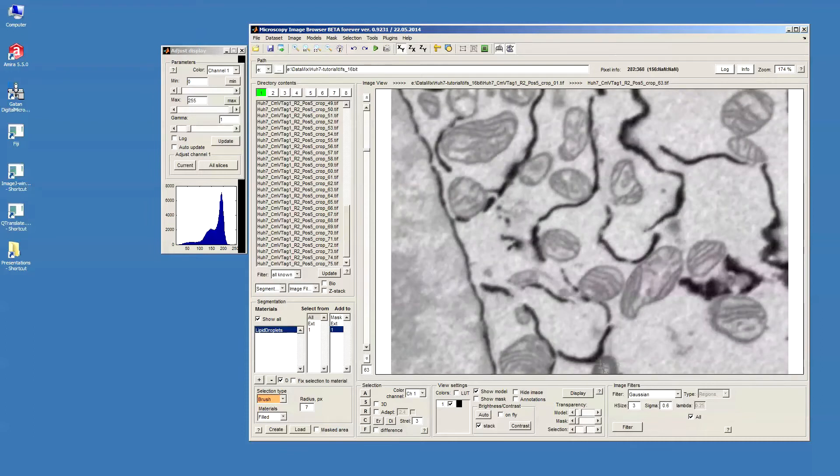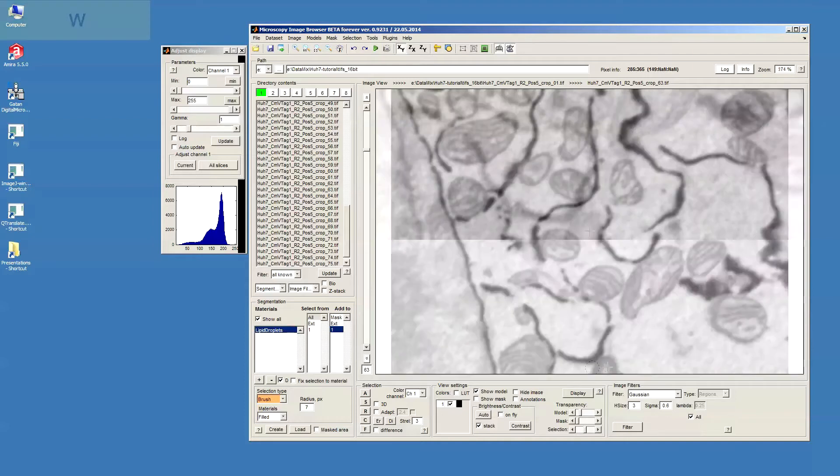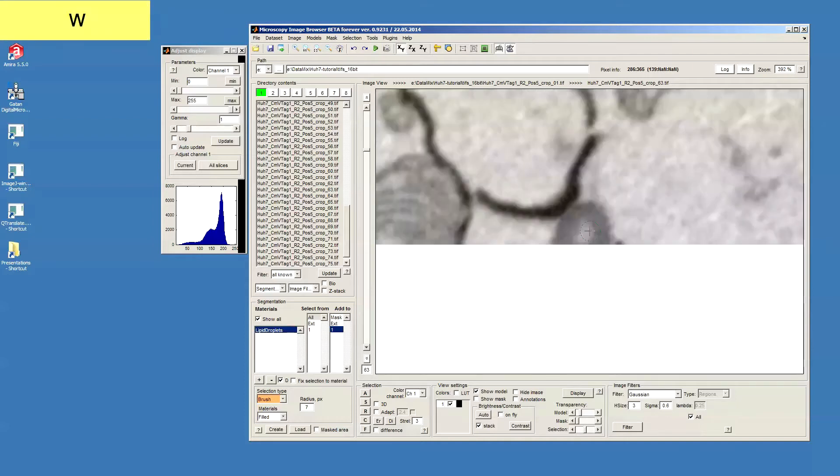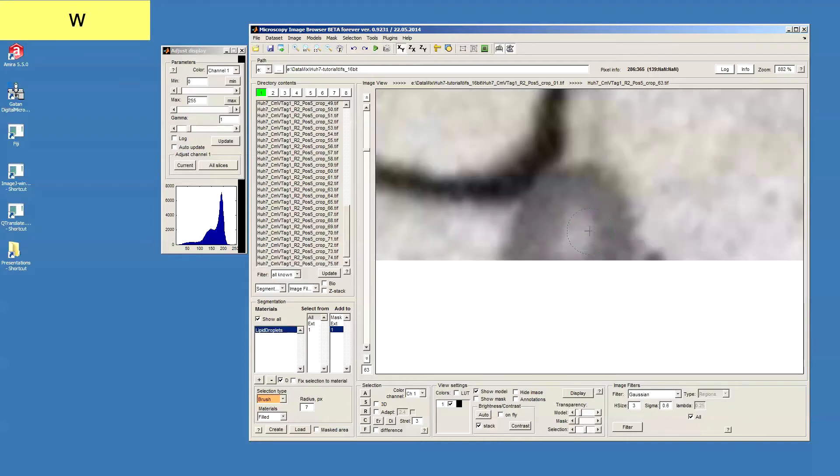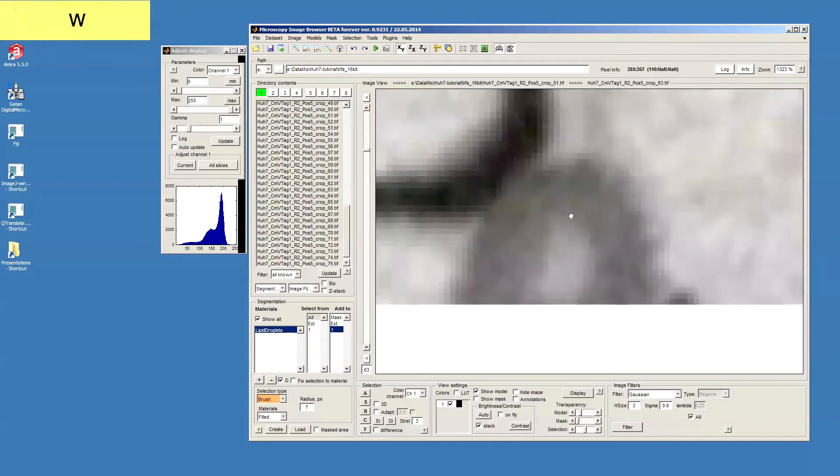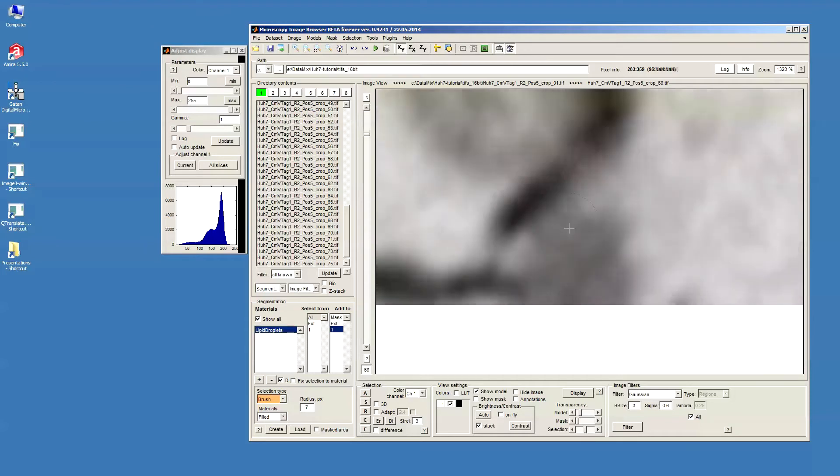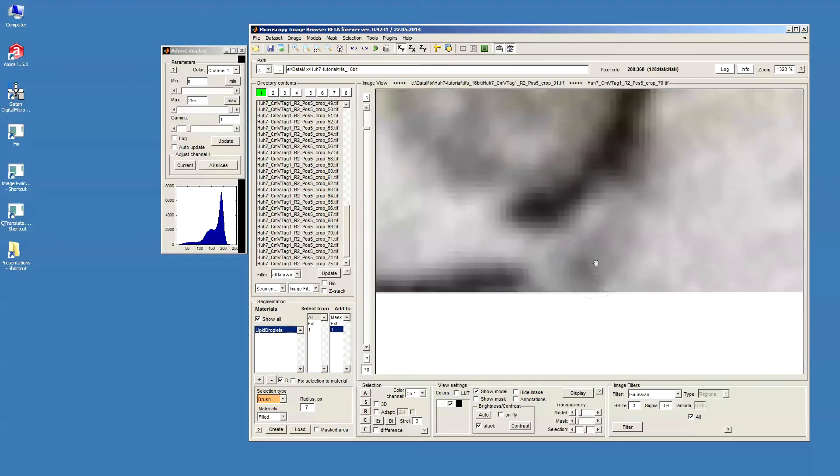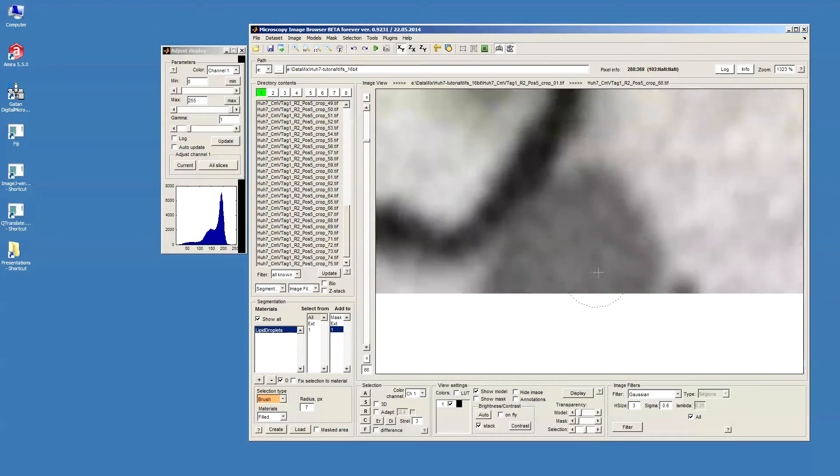Now I can see that here there is a lipid droplet appearing and what I can do is just zoom into this area by pressing W key and then I'm just starting to draw a kind of rough shape around this lipid droplet.